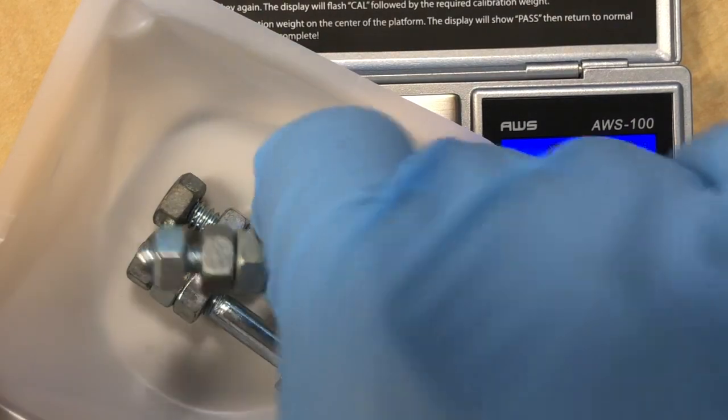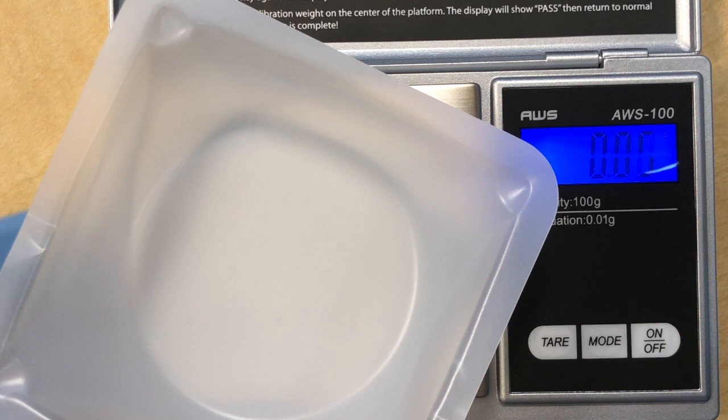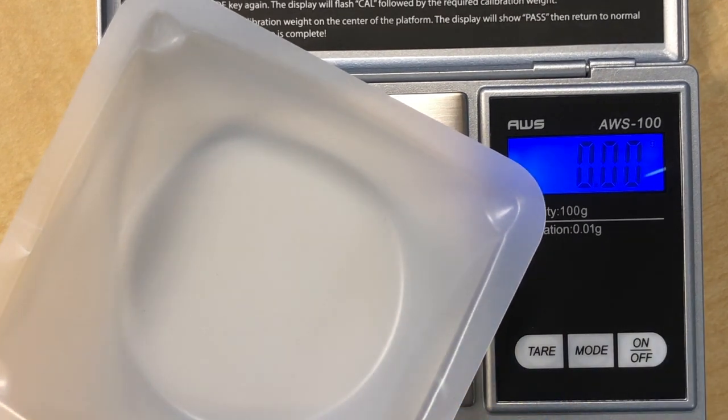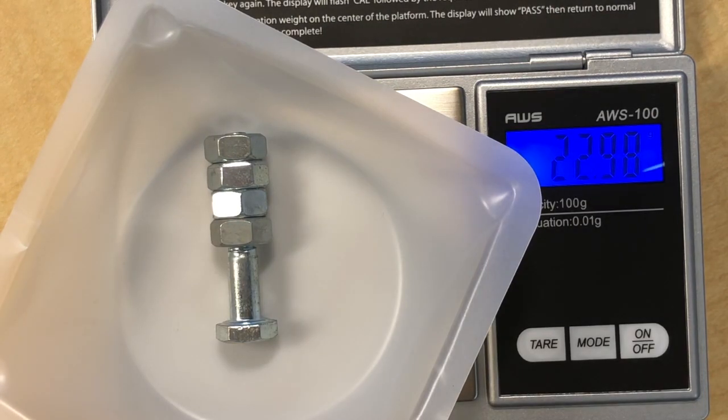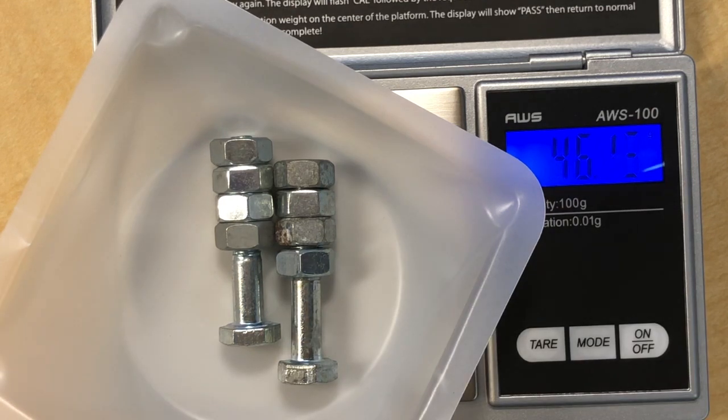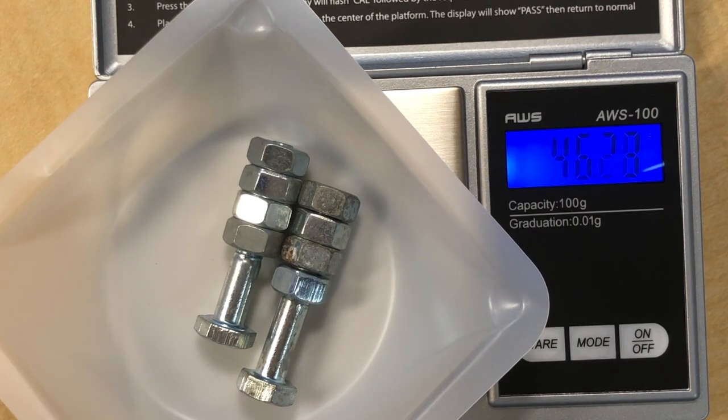You do the same thing for BN4. Remove all the previous assemblies, tare the scale again, and add a fourth nut to each bolt. We can only make two BN4 molecules here. The mass comes out to 46.22 grams, and dividing by two gives 23.11 grams per BN4.